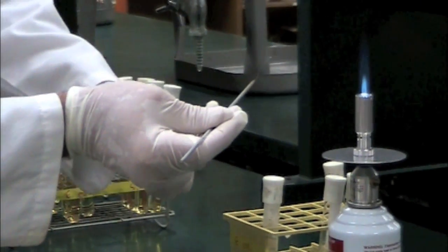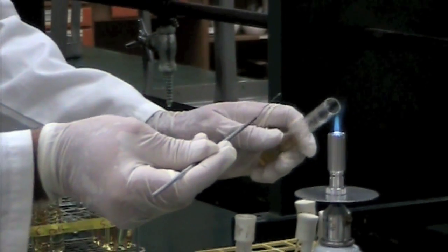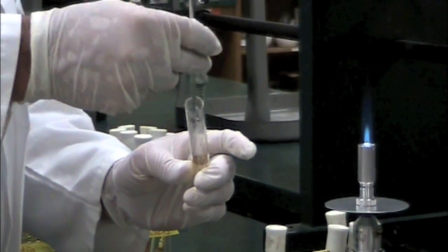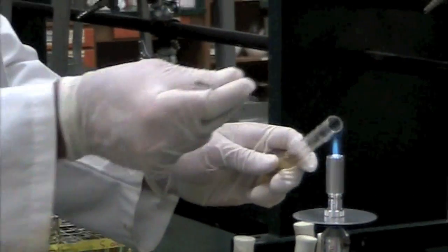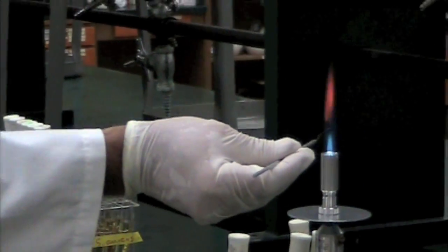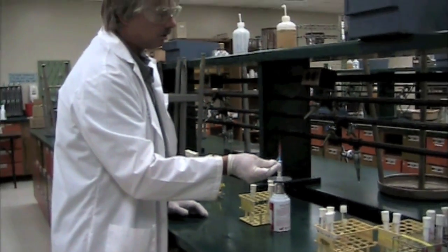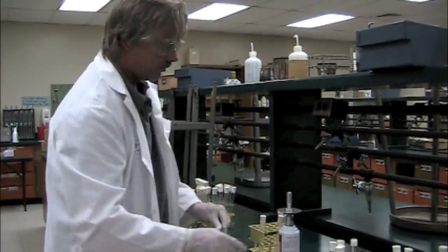Here's my broth. I'm going to uncap it, flame my tube top, and I'm going to take my inoculating loop and agitate it and shake off as much of that inoculum into the broth as I can. Okay? Reflame my tube top, recap it, and the last thing I need to do is to reflame my loop. And that's how you do aseptic transfers in the microbiology lab.